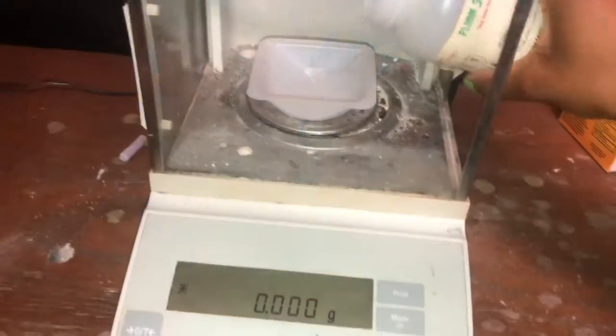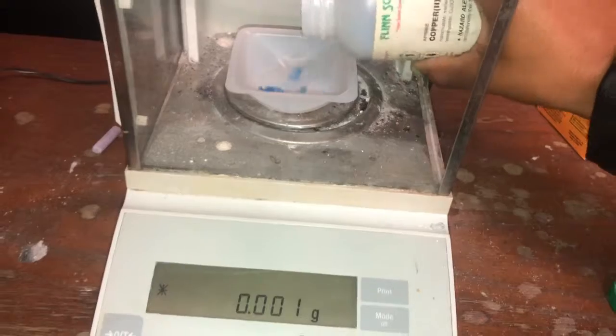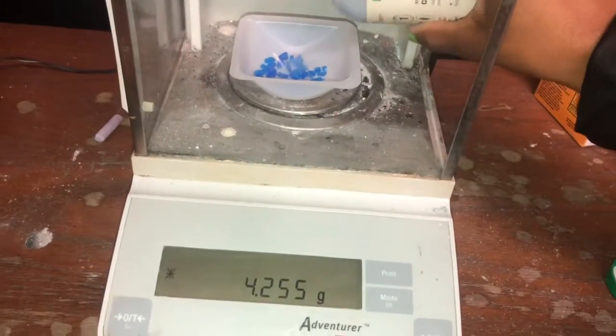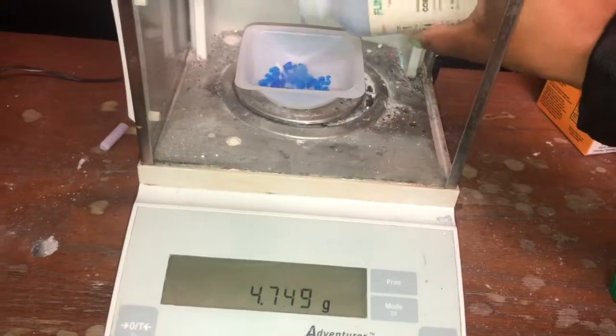Once you finish breaking the seed crystals to the size and shape of your liking, set them aside. Then go and weigh out another 5 grams of copper 2 sulfate from your stock and pour it into your solution. Then place your solution on a hot plate until the solids have dissolved.